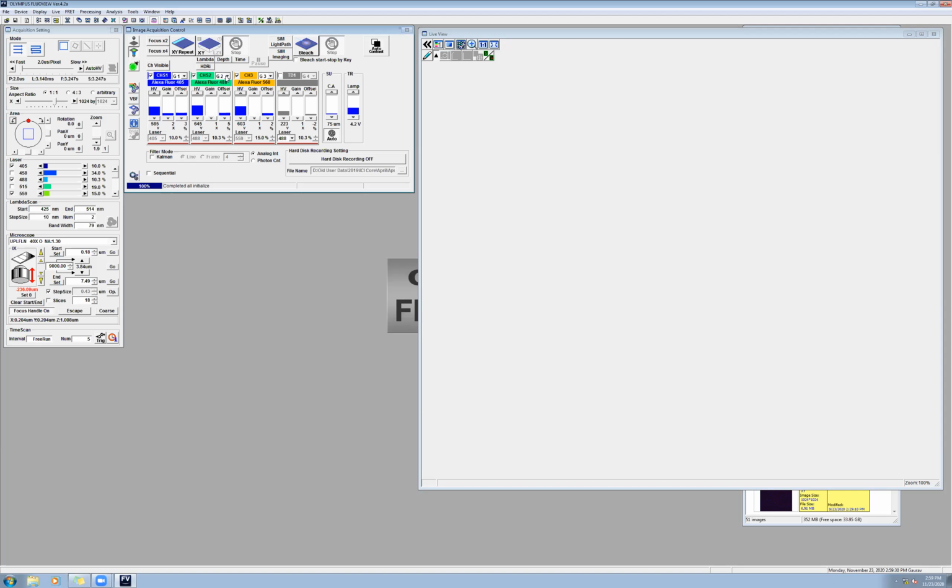We can bring them in the same group, which means channel 1 and 2 will be imaged at the same time by the detector. But let's keep them separate for the moment. The second thing, as I told you earlier, is that once we figure out the colors on our canvas, we have to figure out the laser power, and we also have to figure out the high voltage.